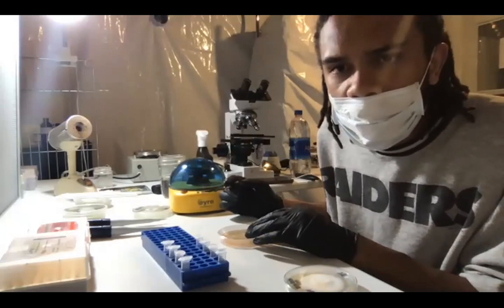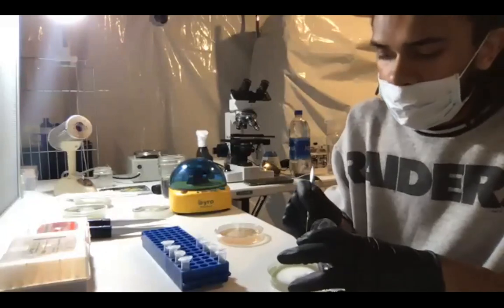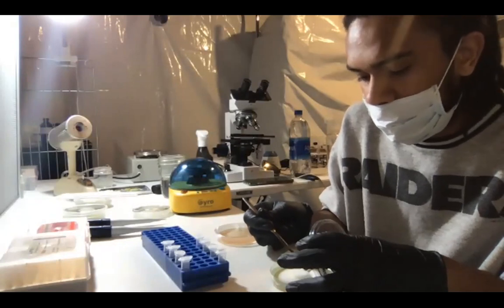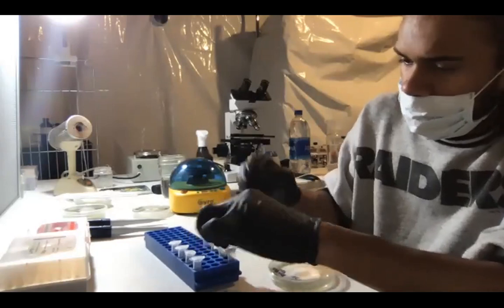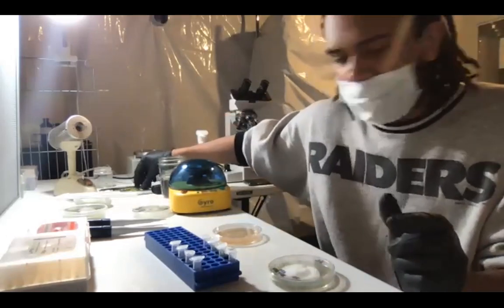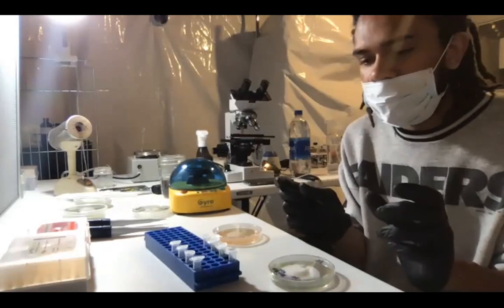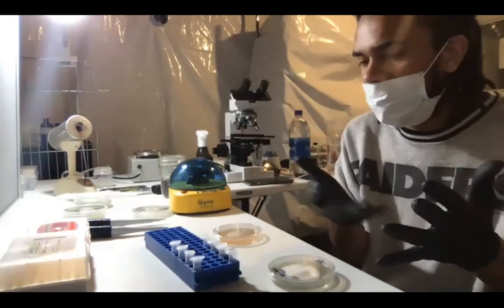Somebody asked me to repeat what I just mentioned about the primers, and what the primers are. All right, so the primers that I'm using are mating primers. I got the primer sequence from the research paper from Korea. Primers are a couple letters of the beginning and a couple letters of the end of a specific gene. Whenever you're running your PCR, they bind to the ends of those genes, and that's where the copying will start and end. It kind of guides the PCR reaction, it guides where the free bases are going to connect to the DNA.